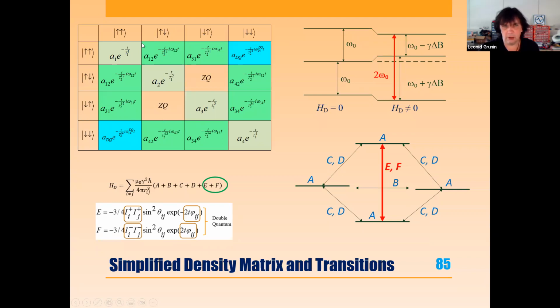Well, we also talked about density matrix, and we noticed that there are these light blue guys who show us the double quantum relaxation. From the point of view of energy levels, if we don't have any dipolar coupling, actually we have only one type of transition which happens on the NMR resonance frequency. And nothing interesting is happening, and we see just one narrow line. But if dipolar interactions take place, then the levels of the two spin system will behave more interestingly. The two mixed conditions that you see in the middle will split, and then we will get two different frequencies that normally form the peak doublet that we already discussed yesterday.